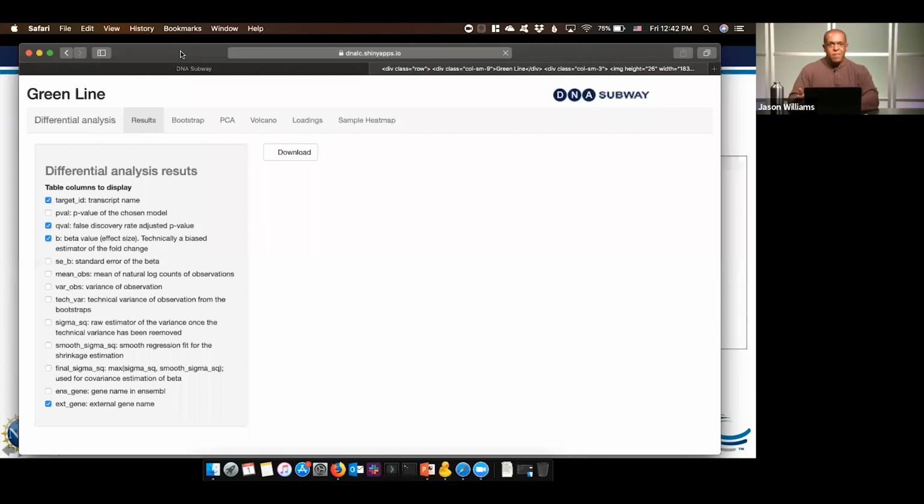The difficulty of using R is if you don't know how to use R, you're not very comfortable with it, it can be a lot to get started. And so generating visualizations and graphs of things that are going on may actually be a little bit difficult for you to do. And rather than making you learn those command line things in order to generate them, what this gives you is the option to have them in a point-and-click way.